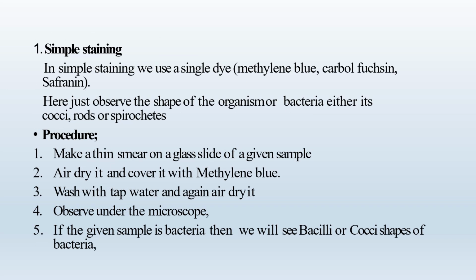First, we will discuss simple staining. In simple staining, we use only a single dye that can be either methylene blue, carbol fuchsin, or safranine. In this staining, we just watch the shape of organisms, whether it's rod, cocci, or spirochetes.